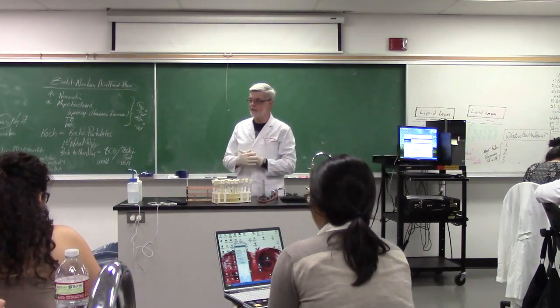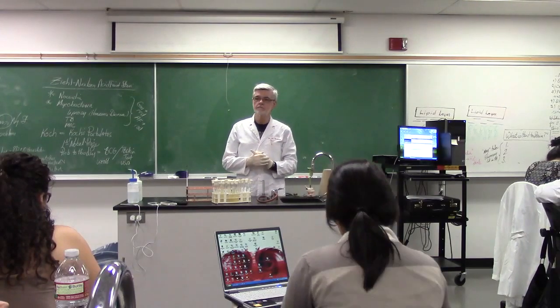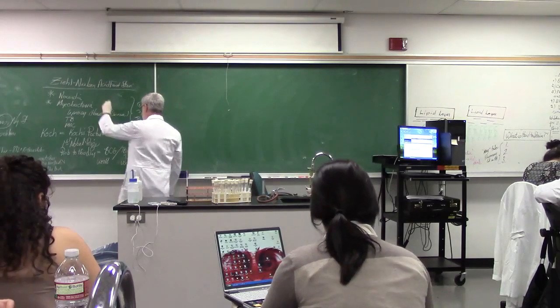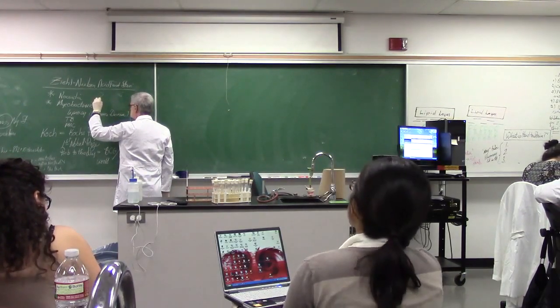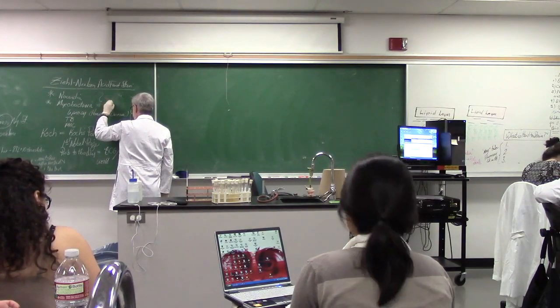Chemistry. Something about the chemistry. And for instance, in acid-fast staining, what does it tell you? Presence of lipid layer. Lipid layer is the chemistry. The chemistry for gram stain was? The cell wall thickness. Cell wall thickness. This is lipid layer.